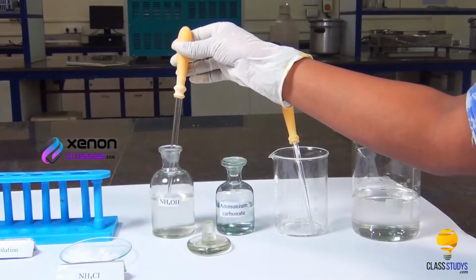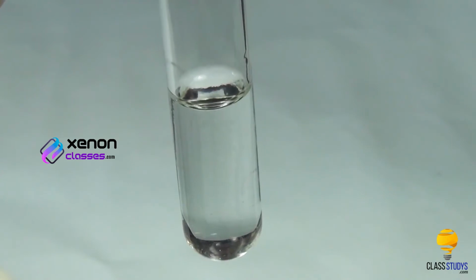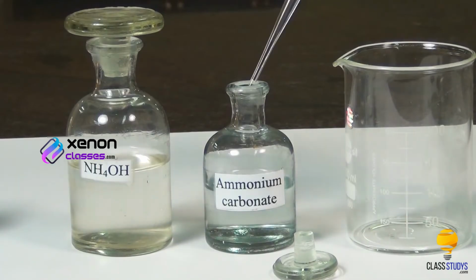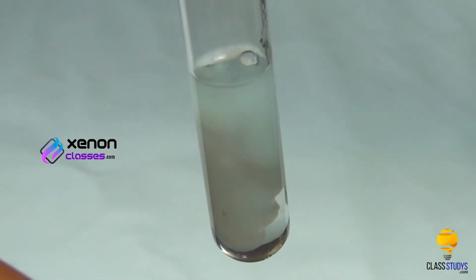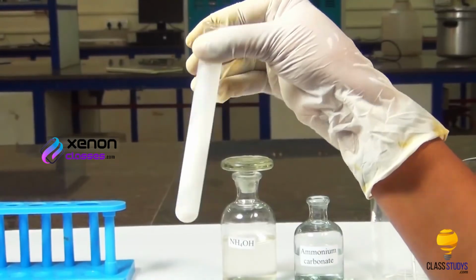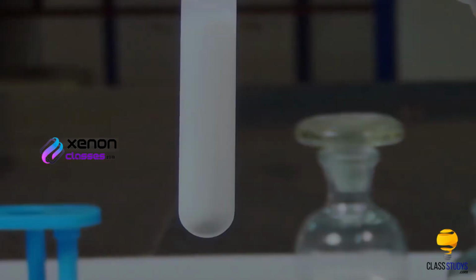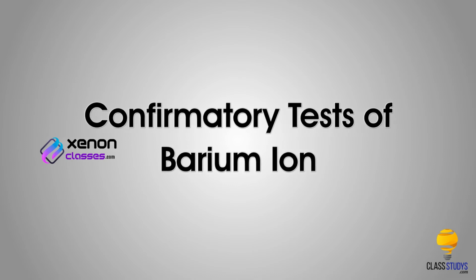Using a dropper, add ammonium hydroxide to the test tube till the solution smells of ammonia. To this, add ammonium carbonate solution using another dropper. Barium ions in the solution react with ammonium carbonate to form a white precipitate of barium carbonate. Finally, we look at the confirmatory tests of the barium ion.